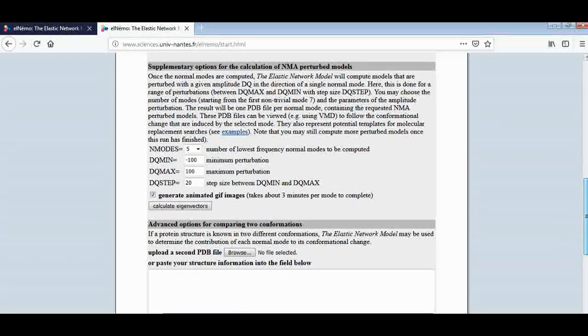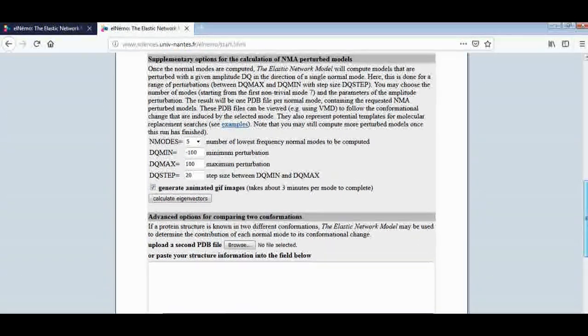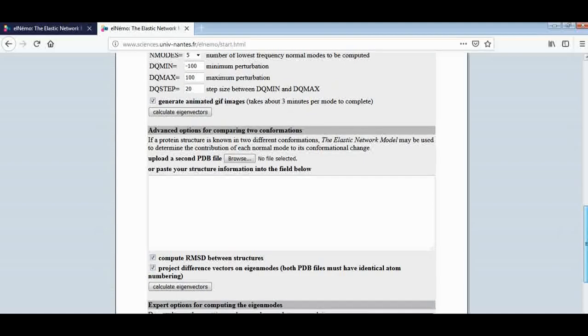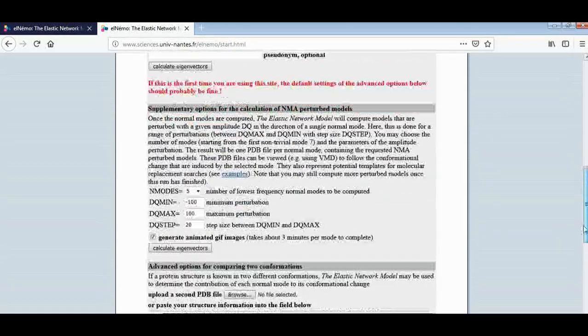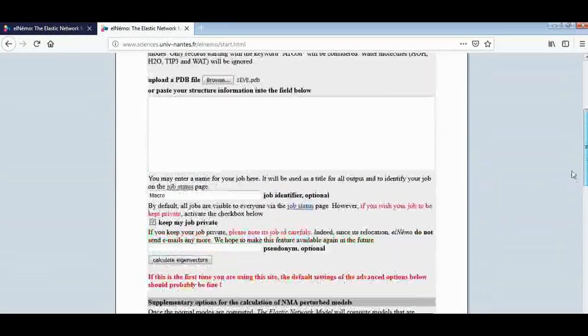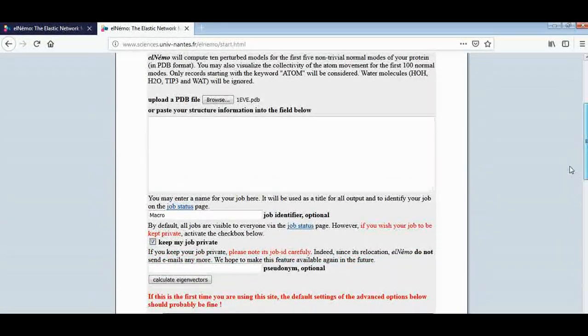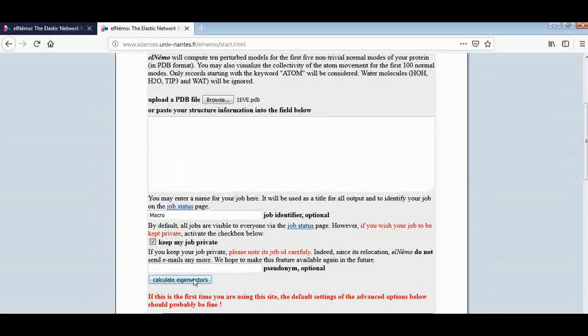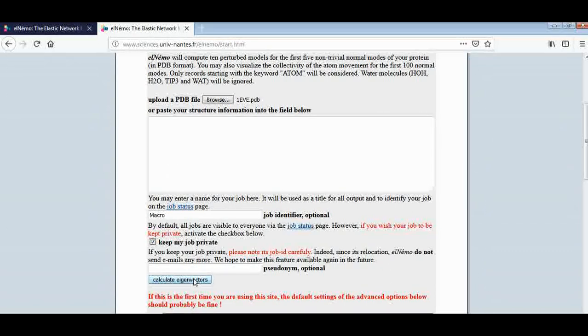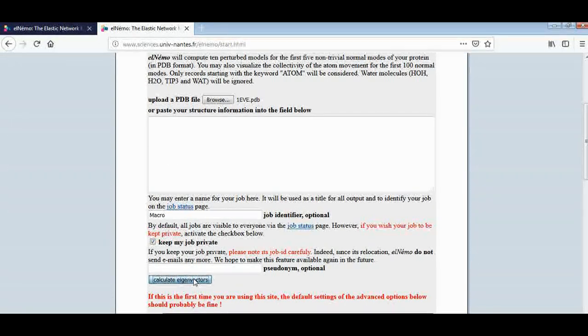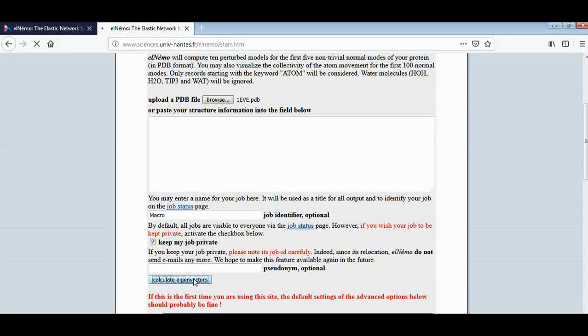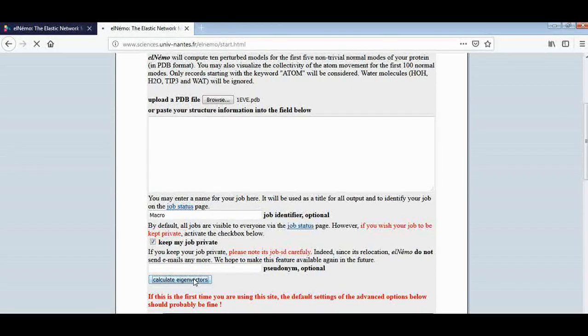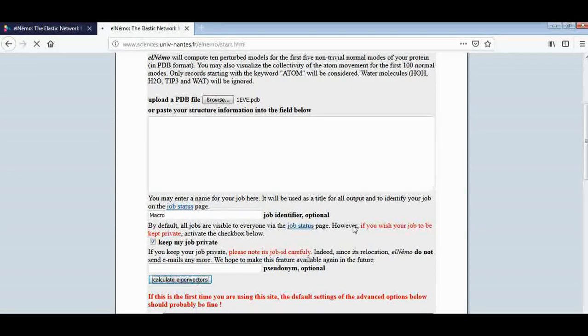Right now I would like to tell you about checking the elasticity of one macromolecule only. Here, press calculate eigenvectors. And now you can see the job is running and this is your request ID.